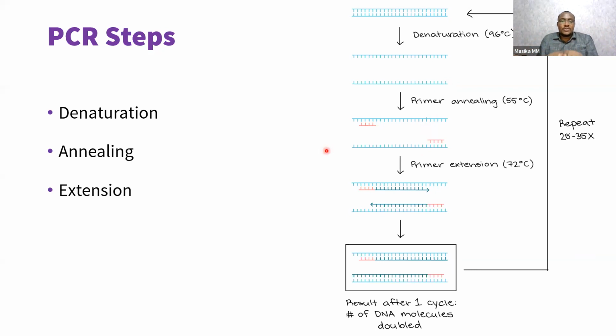Now the challenge is, how do you select which portion? You have to make sure the portion you're selecting to target is unique to that organism, so that if you target a portion, it is able to tell you this is dengue. If you target a portion that is for flaviviruses in general, it can tell you this is flaviviruses. If you're targeting a portion for humans, it can tell you these are humans and not pick plants or something else.